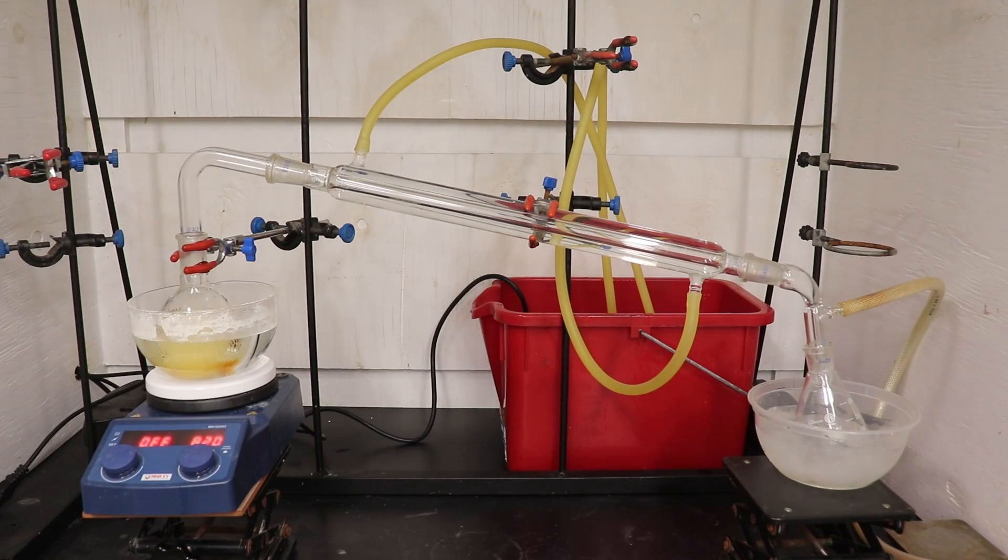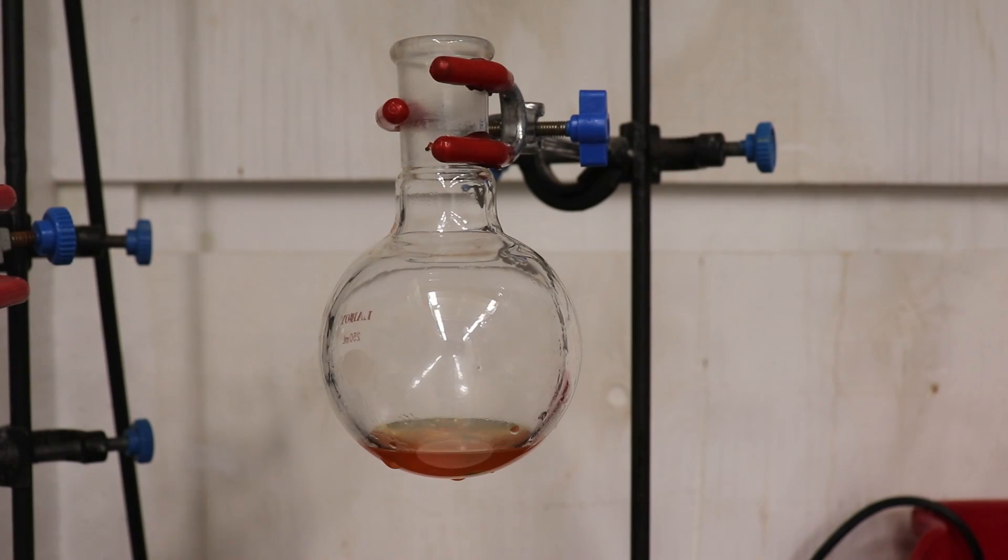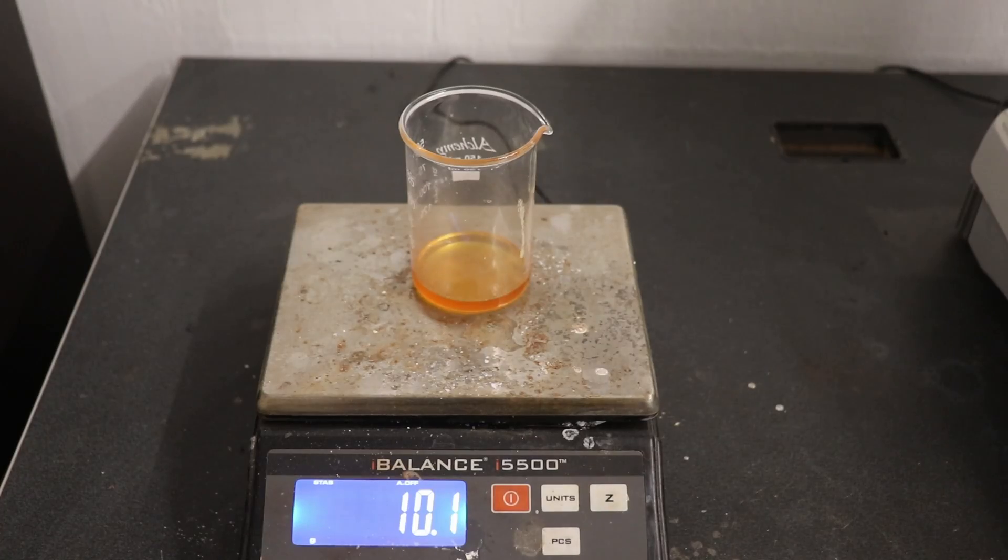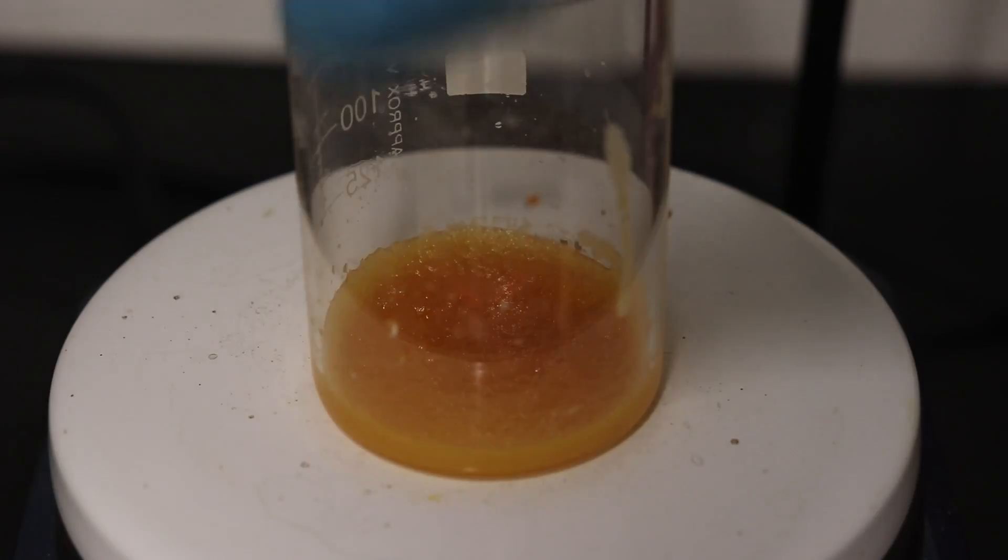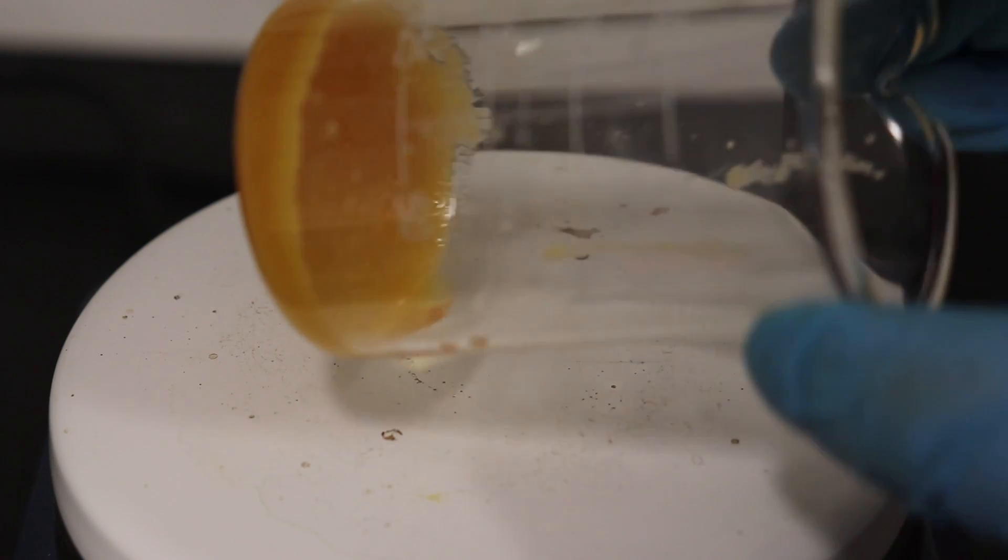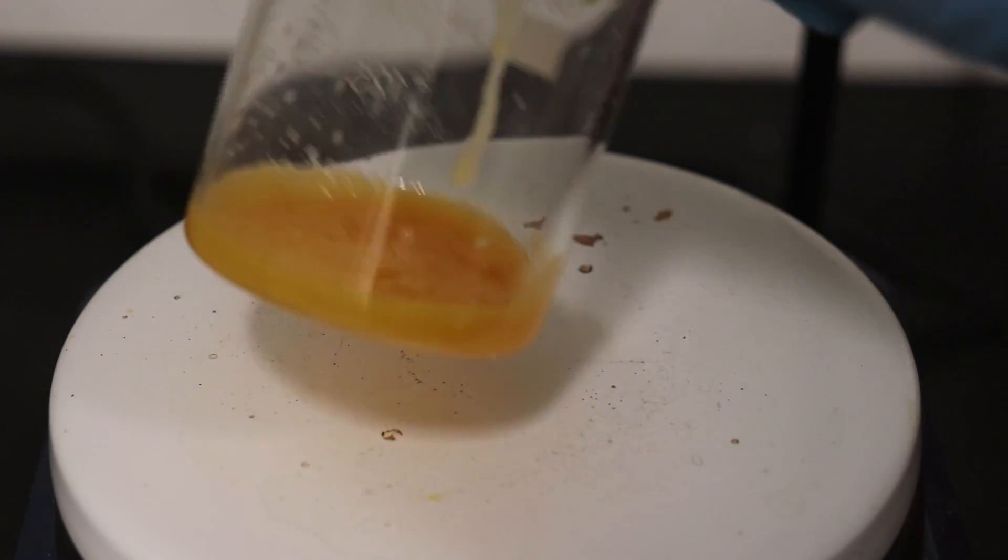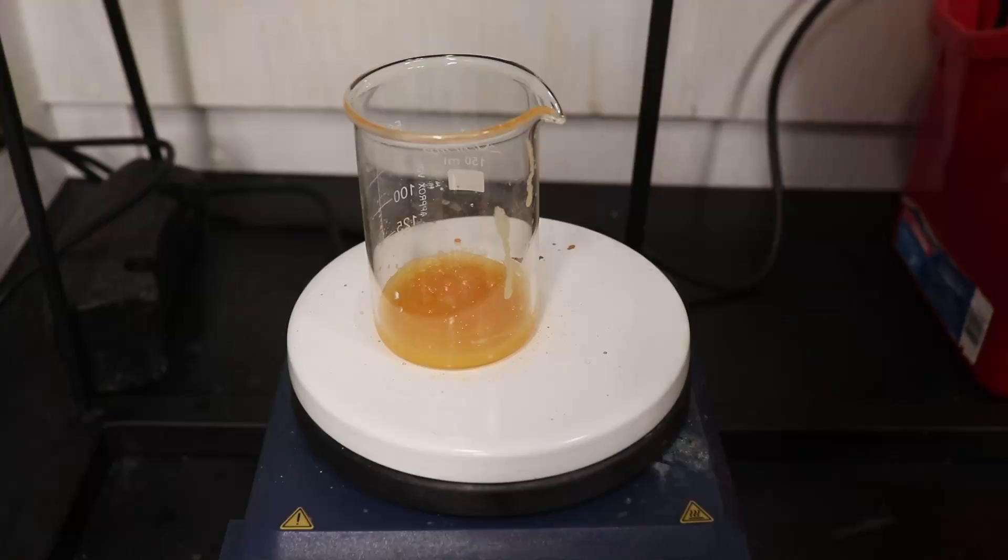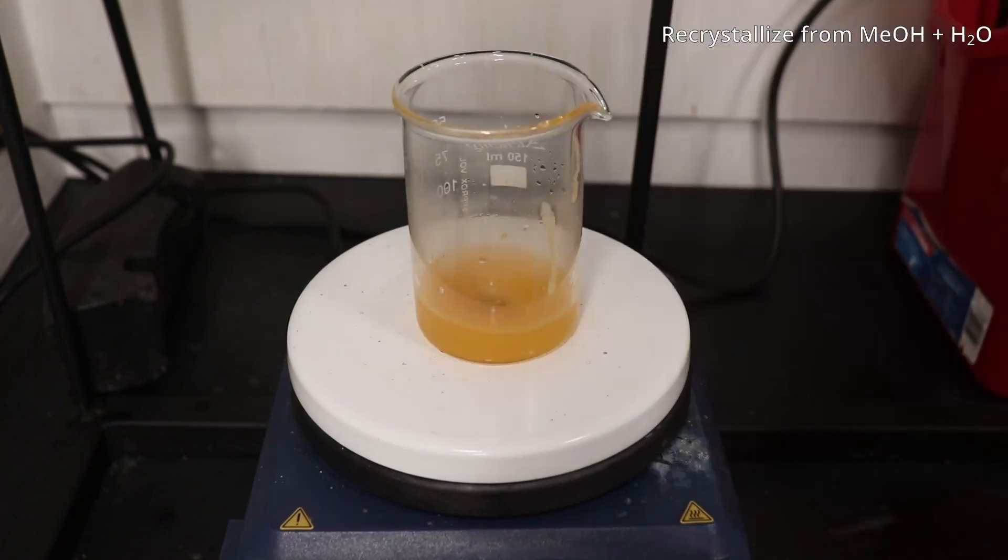After the rate of distillation slowed, the residual ether was stripped off under vacuum. This left us with 10.1 grams of very crude biphenyl representing a 70 percent yield. The paper reported a 90 percent crude yield and I have some ideas on why our yield might be lower, which I'll talk about later on.